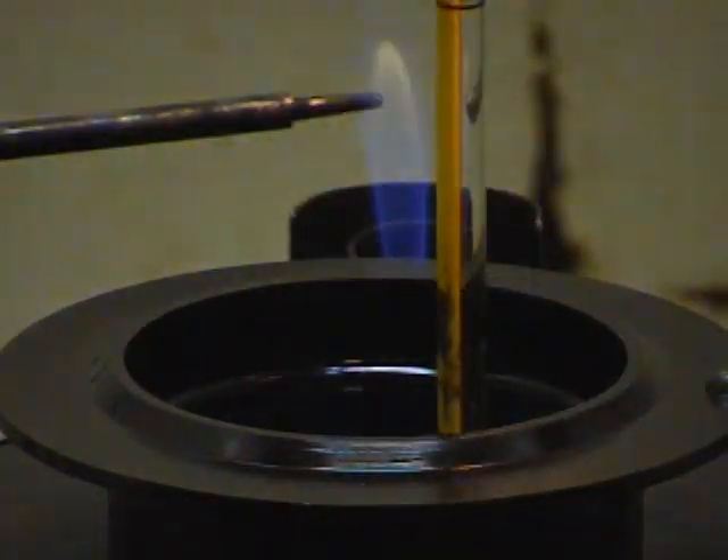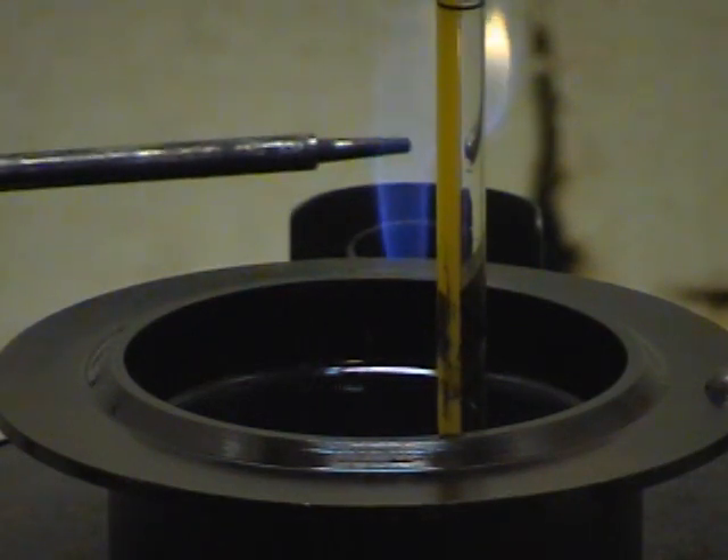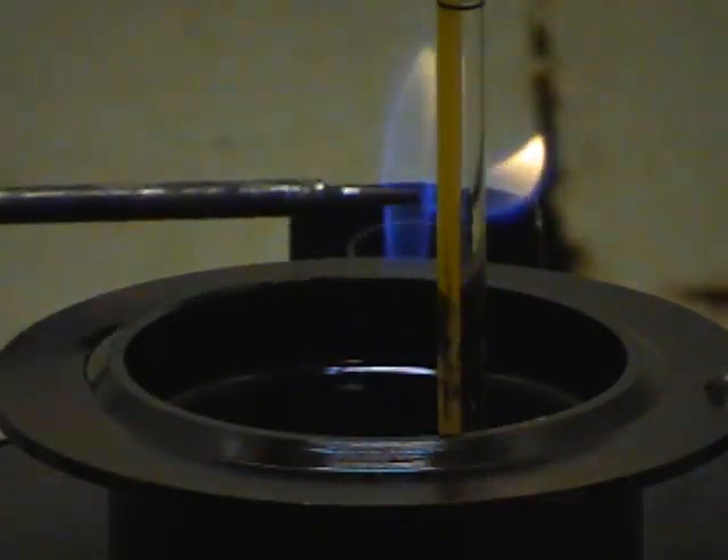Mike is turning the gas three-quarters of the way and he's going to reach under there and light the Bunsen burner. He's going to light this — the temperature of the oil is 100 — so we're going to attempt to get a flash point here at 100.